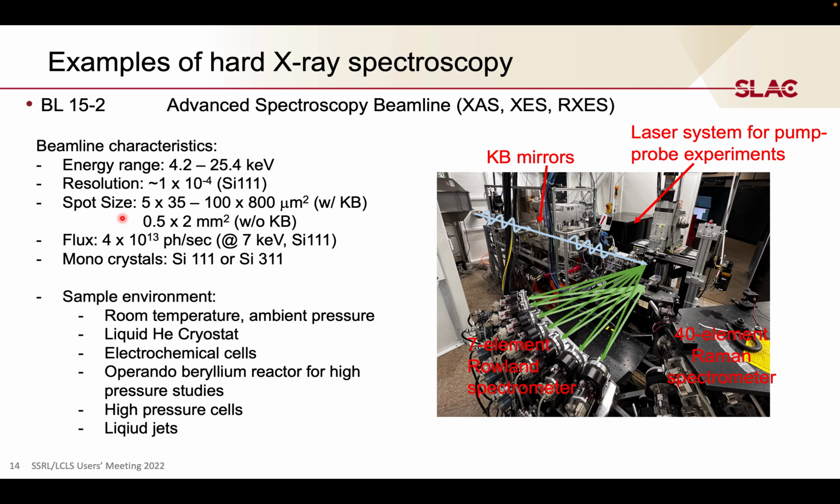Sample environment is pretty much the same, since it's all hard X-rays. Since we can bring down the spot size so much, we can also do high pressure cells, like using diamond anvil cells, and you can use liquid jets.